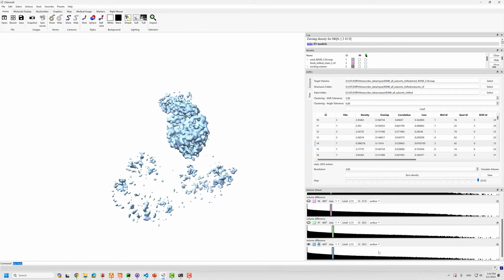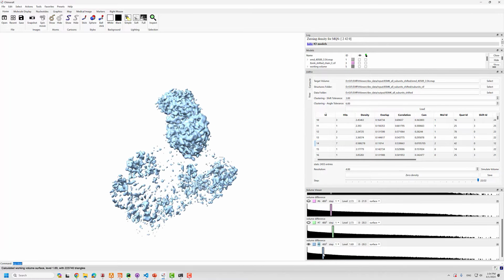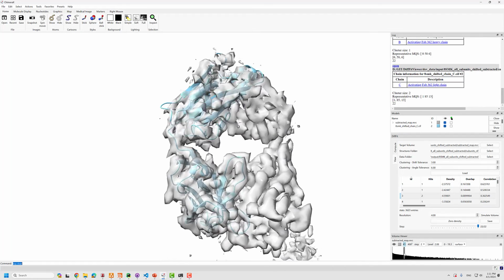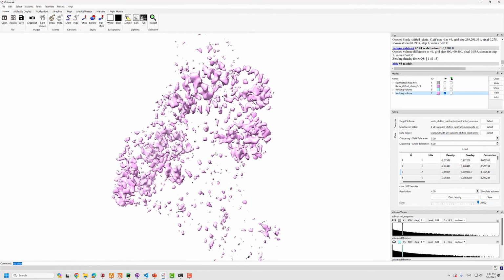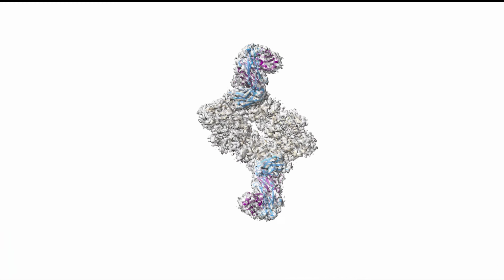The voxels corresponding to those subunits in the target map are zeroed out to prepare a subtracted map for the second round of fitting, in which stage the remaining copies of the 2 smaller subunits get identified. As there are no significant areas left in the target map, the compositing finishes and we get the complete structure in 30 seconds of computation time and approximately 5 minutes of human-in-the-loop interaction time.